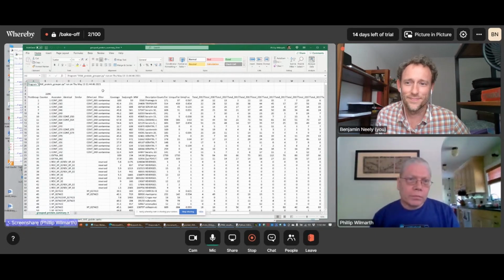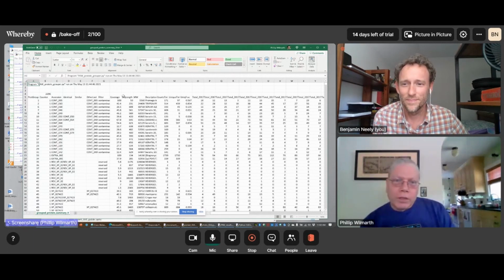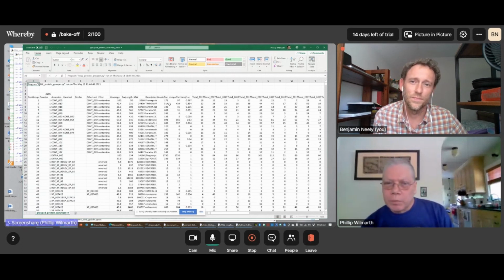But this is still a little bit old school, so we kind of have to explicitly prepare the FASTA file for the Comet analysis, and we don't use the built-in decoy option in Comet. Okay. And then we have sequence length, sequence coverage, protein description string. Then we get our spectral counts for the different proteins, kind of a basic thing.